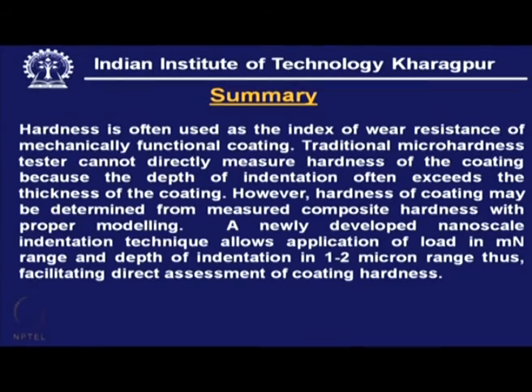A newly developed nanoscale indentation technique allows application of load in the few hundreds of millinewton range and depth of indentation in the 1 to 2 micron range, thus facilitating direct assessment of coating hardness.